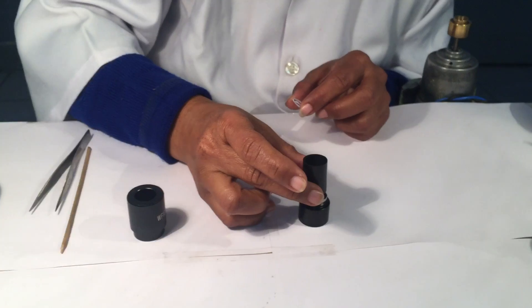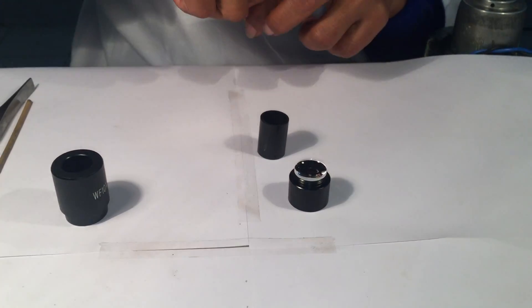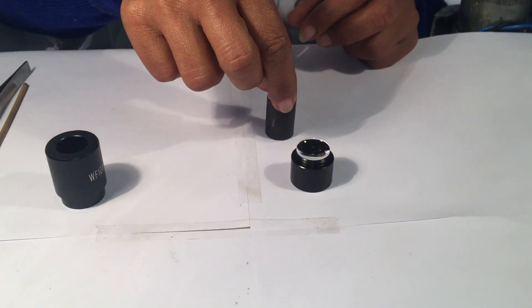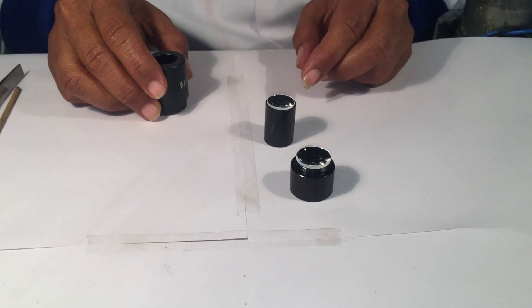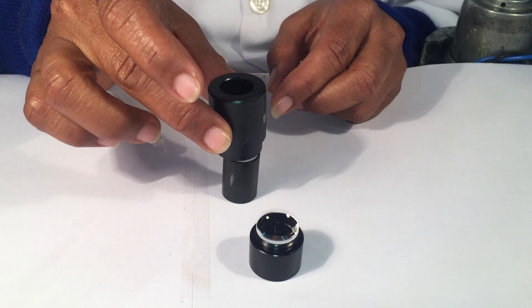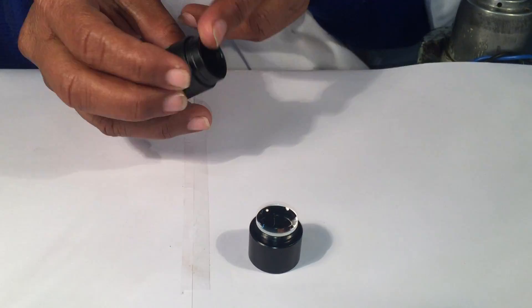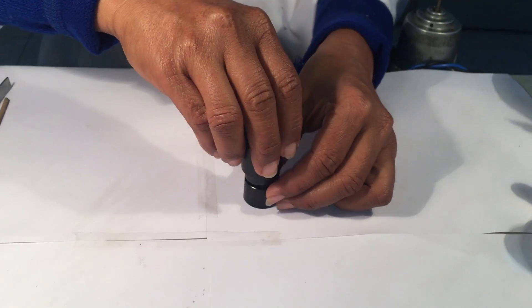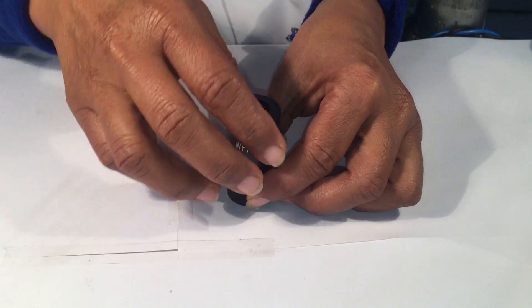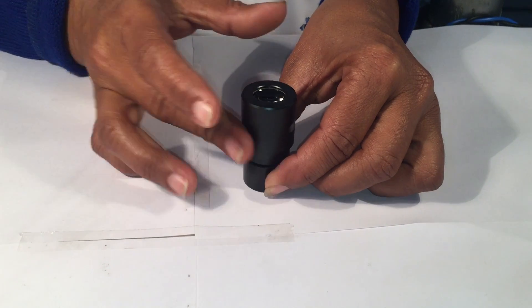Once all the parts are done, we take the eye lens, put the flat surface of the lens on the upper part of the spacer. We place the upper part properly. And then we will take all the parts together and screw them on the lower part.